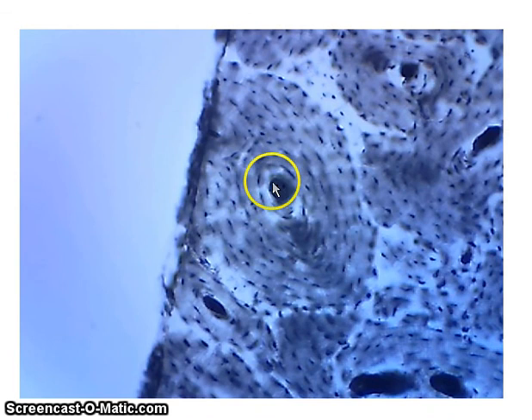In the center, we have our central canal, and then you can see these dark little lines that go around the central canal. They're forming little rings going around the central canal. These are the osteocytes. And remember, these live in little spaces in the bony matrix, and those spaces are called lacuna. And so these dark structures here are the osteocytes in their little lacuna. And if you notice, you can see kind of concentric rings of these osteocytes. And so the distance between two rings, that is what we call a lamella, or a layer.